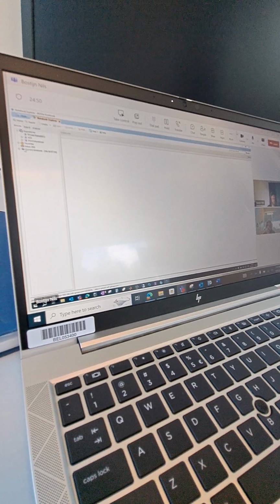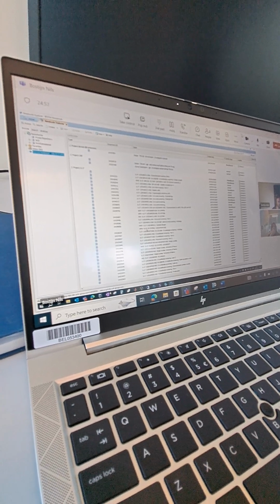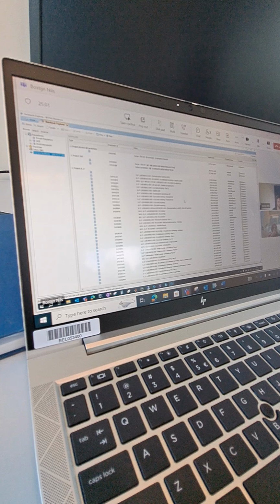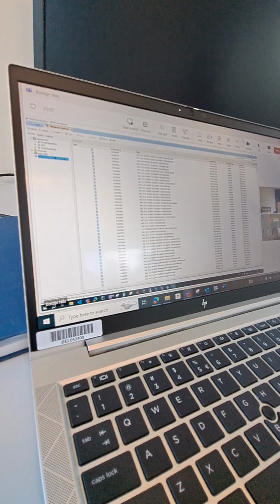Normally for you, if you click here on Current Notebook, you will see all your ELNs. For you, at the beginning, it will be only one line. So here, this is my notebook. Each line is one ELN.